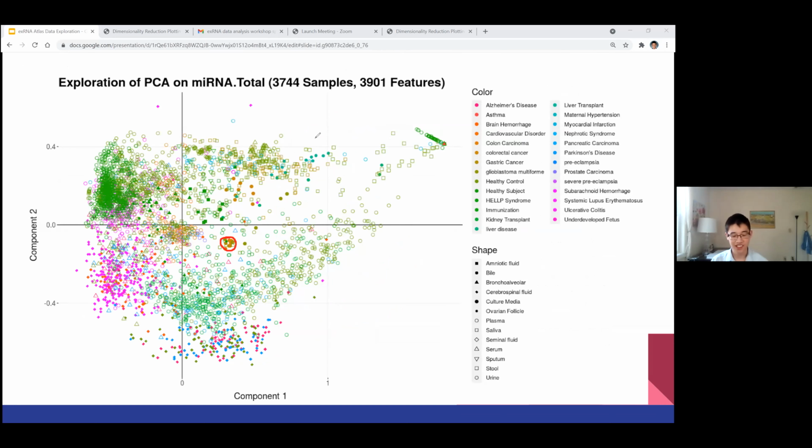That would be, of course, very far into the future, but potentially that would be a useful application in line with the ERCC's mission to develop useful diagnoses based on extracellular RNAs. But yeah, PCA is not the most sophisticated method we could use for this. Of course, experimenting with different methods is important too, and it would need to be supplemented with the context of the patient's condition and so forth.